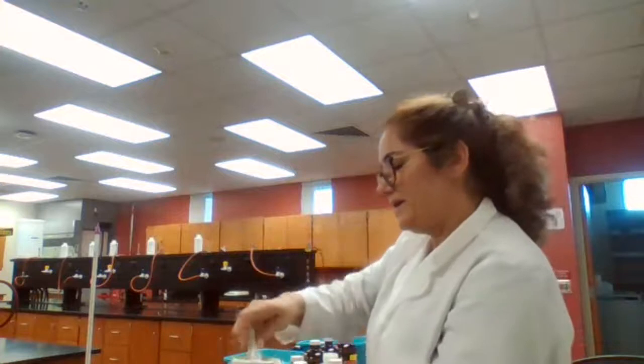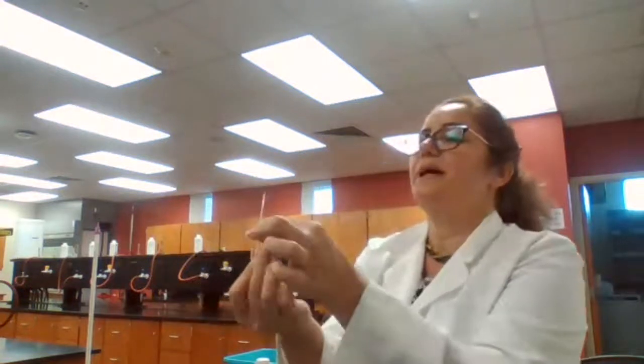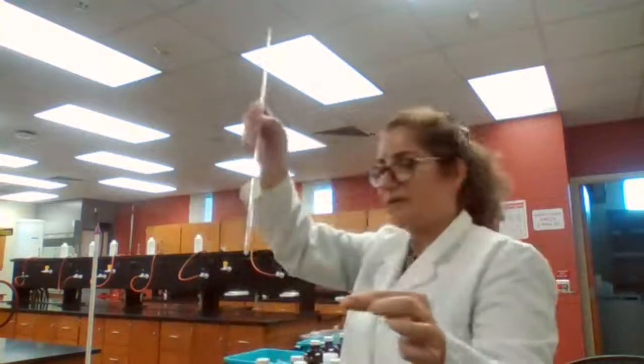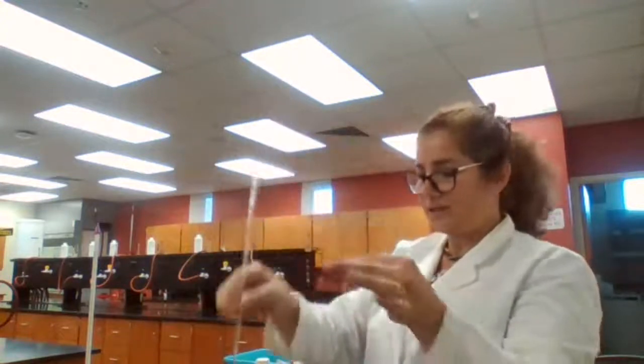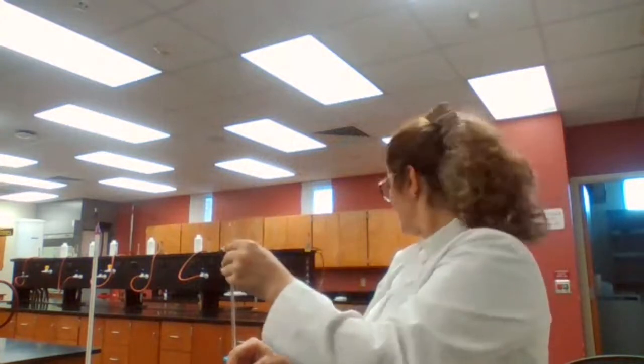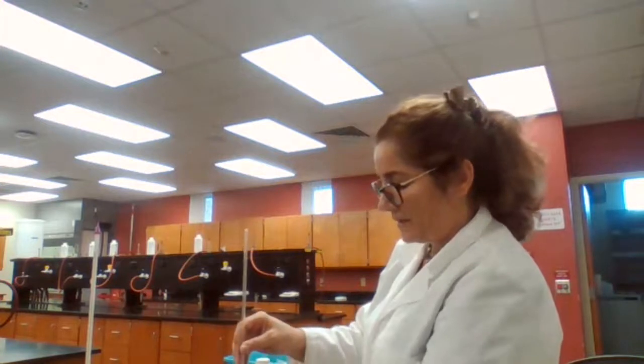And then I use the capillary tube. I dip into the sample a few times. I get some of the compound into the capillary tube, but it's all the way up here. And because it's all the way up, I'm going to pass it through a glass tube. It's a hollow glass tube. I pass it through this. The sample is going to go all the way down.